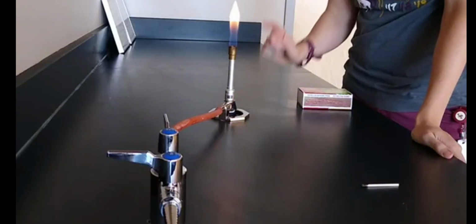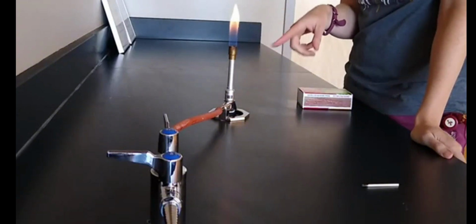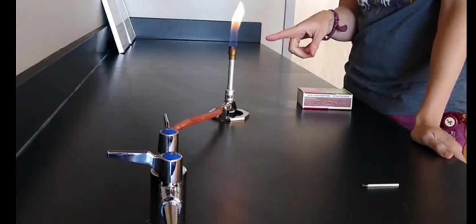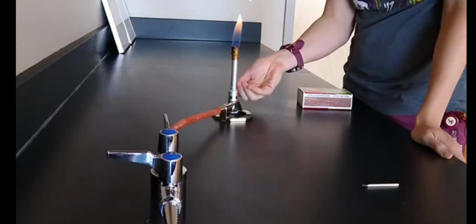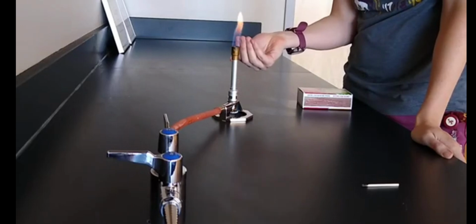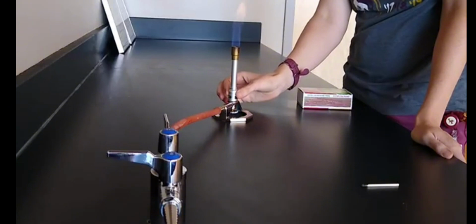Now the reason why this is not a stable flame is because it's flickering. It's not high temperature because it's orange. Higher temperature flames are going to be blue in color. So we're going to open this valve, this air vent, excuse me, and that's going to allow air to come in here and mix with the gas before it lights on fire up at the top of the burner. And when you get that ideal ratio of air, which has oxygen in it, to methane in our natural gas, we start to get a higher temperature flame.